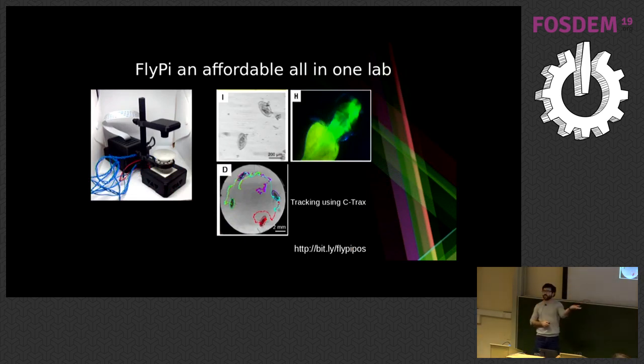This doesn't have a scale, but it basically fits on the palm of your hand, and you can power it with batteries, so you can take it anywhere. We're going to see a little bit more details in a bit. You can also do videos with it.